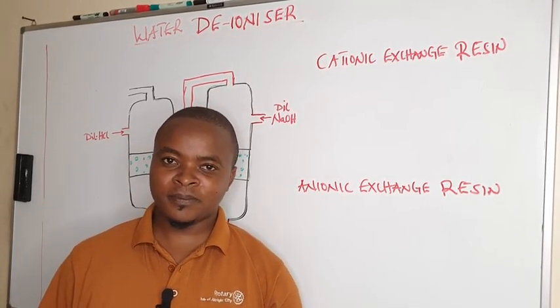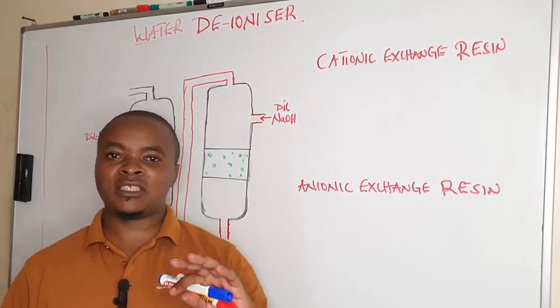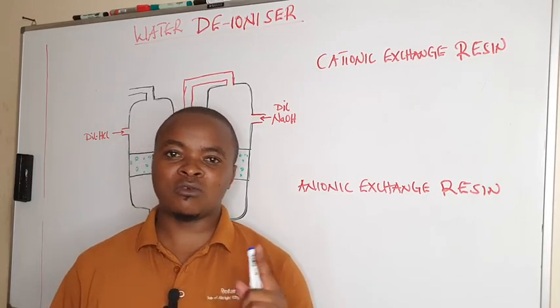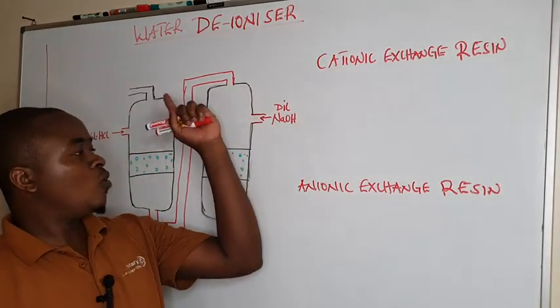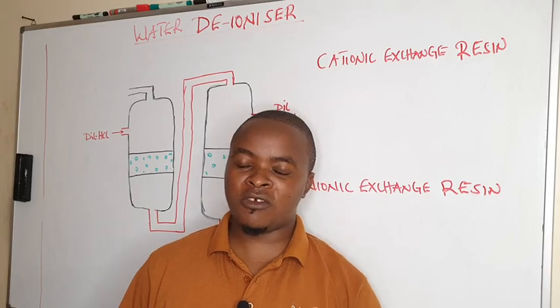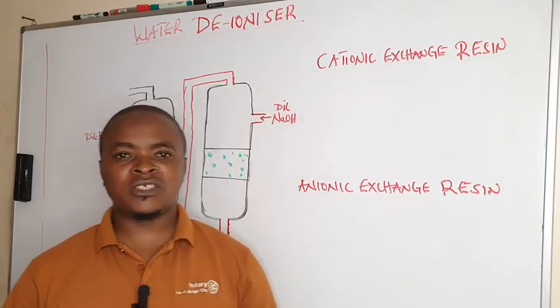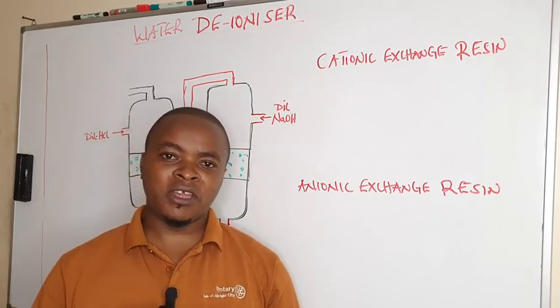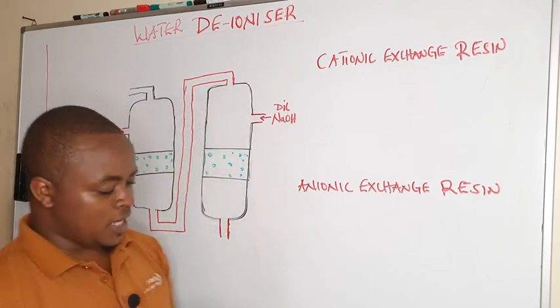So in this video, we are looking at water purification methods. And today we want to look at what we call water deionization using a machine known as a water deionizer. You can ask yourself, why do we need to purify water? By removing minerals.